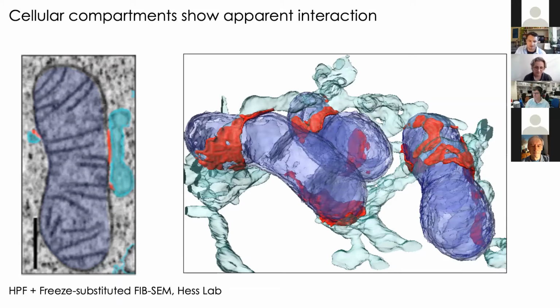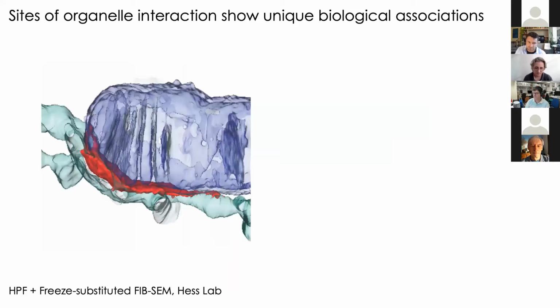So you can see here just an example of one particular mitochondria where you can see the cristae of this mitochondria are all lined up so that one of their ends is at the mitochondrial membrane in a place where it's directly contacting the endoplasmic reticulum. And that's actually true for the vast majority of stacked cristae in tissue culture cells.